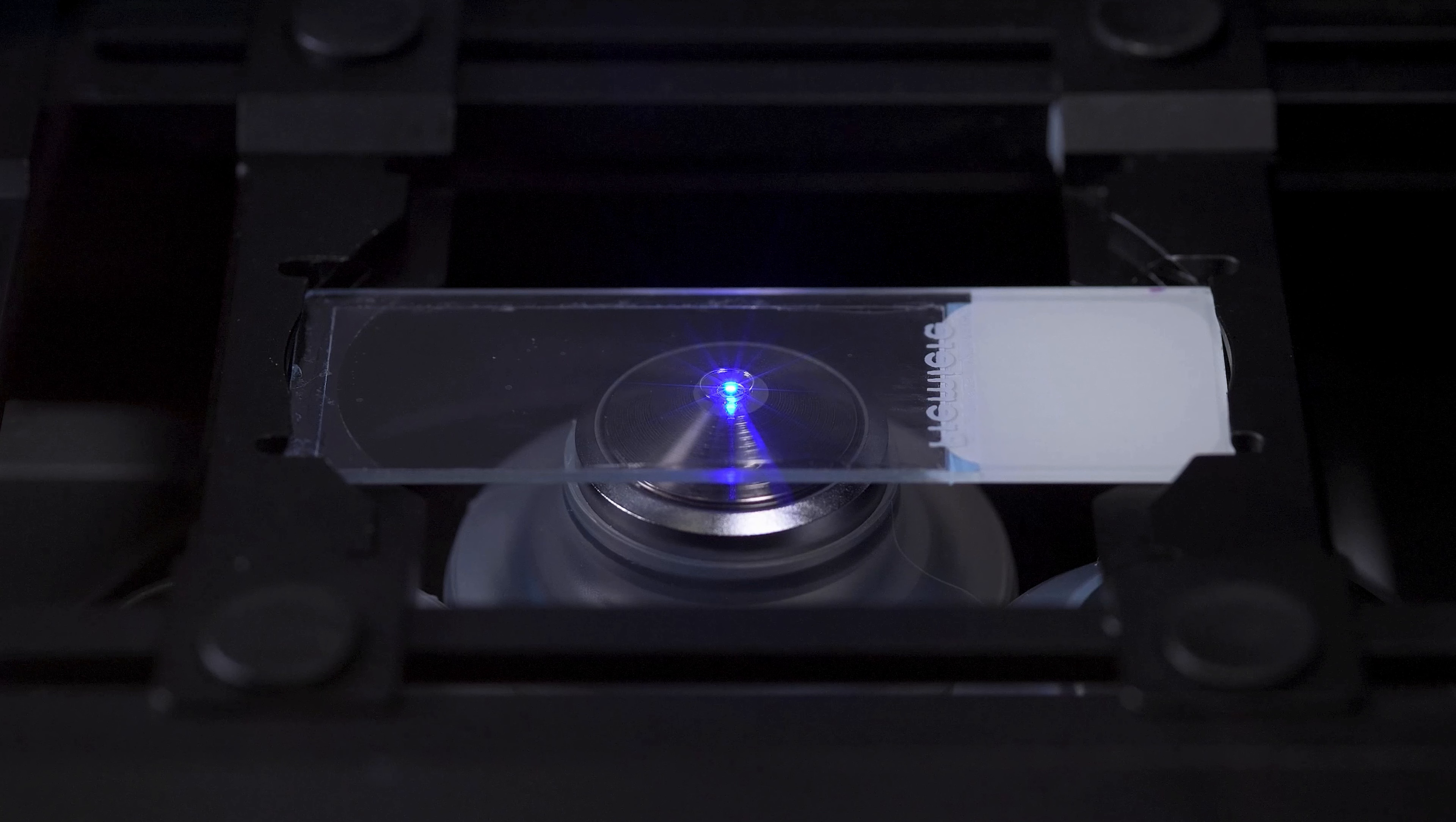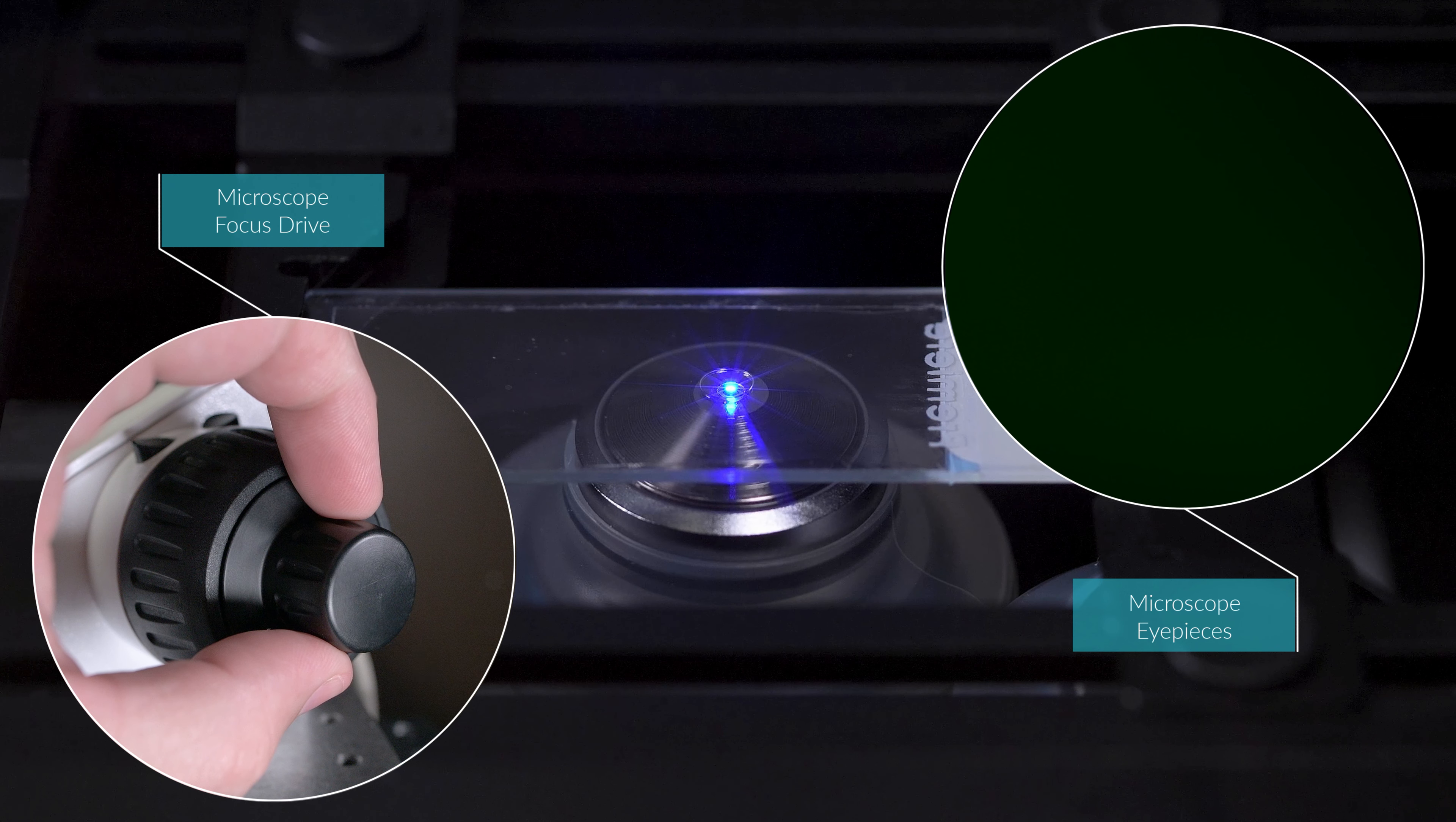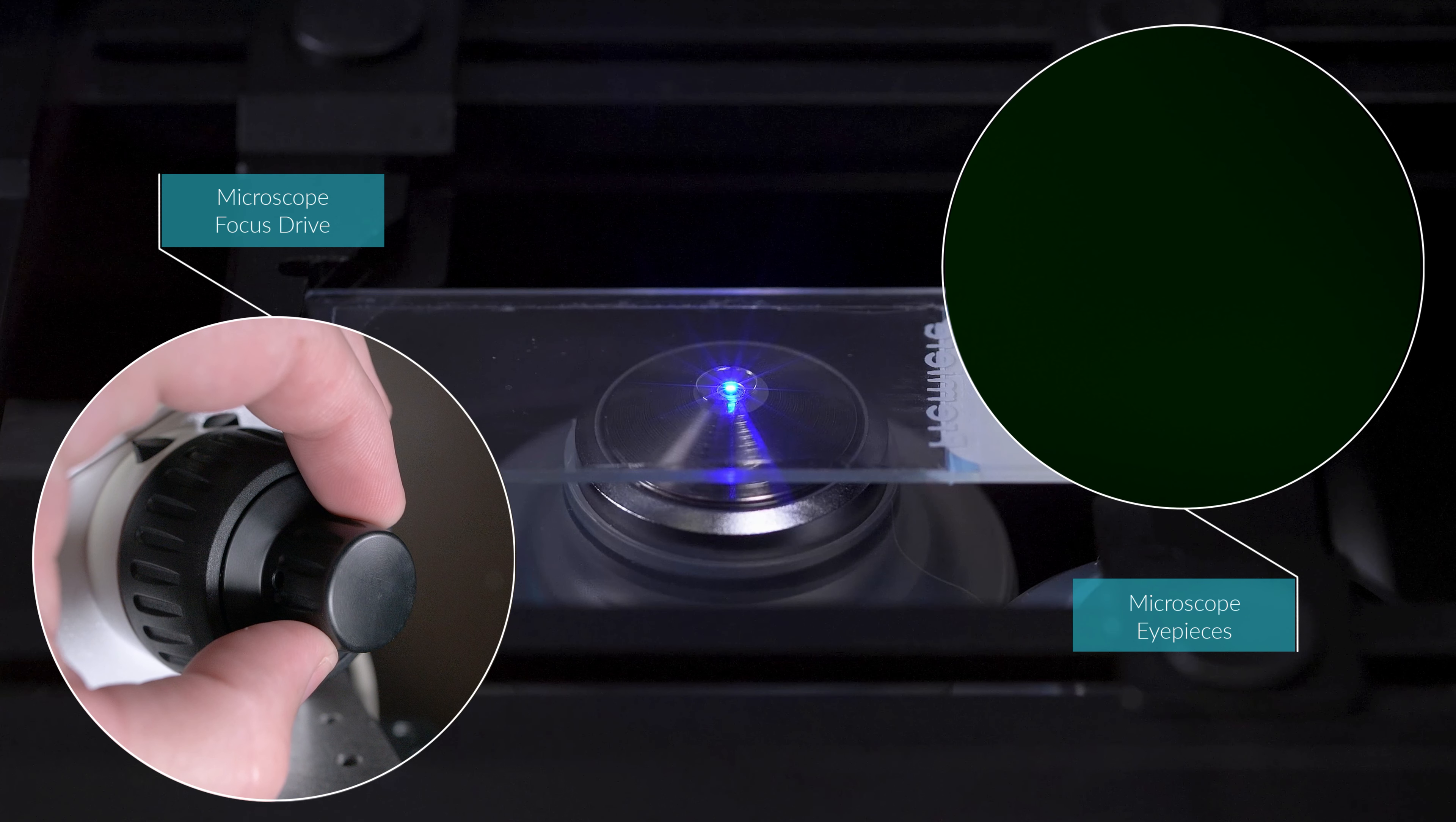Do not use the coarse focus with immersion objectives from this point on. Have a look through the eyepieces of the microscope. If you position the bead of oil over a section, you will likely see some residual out of focus fluorescence from the tissue. Begin slowly rotating the fine focus knob towards the microscope. As you slowly adjust the focus, you should see the entire field of view starting to get gradually brighter and brighter as you get closer to the specimen.